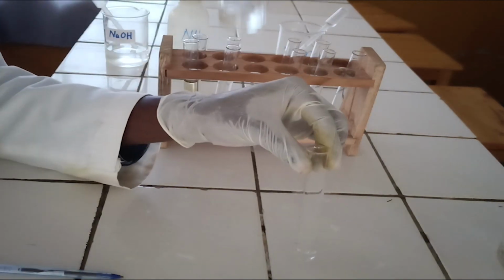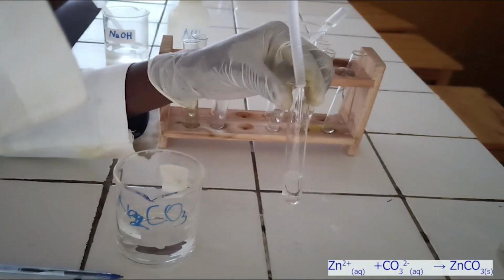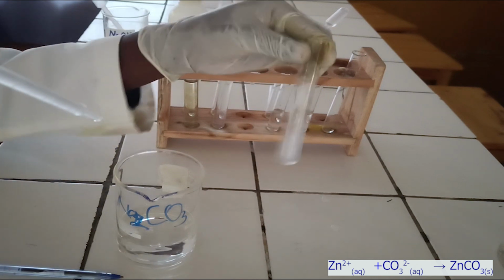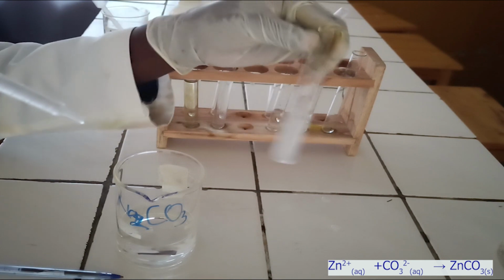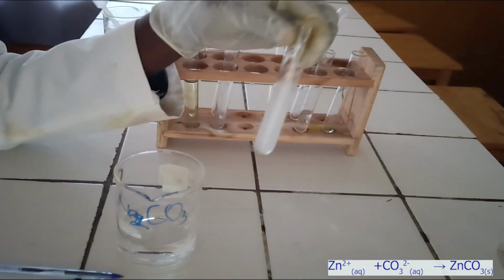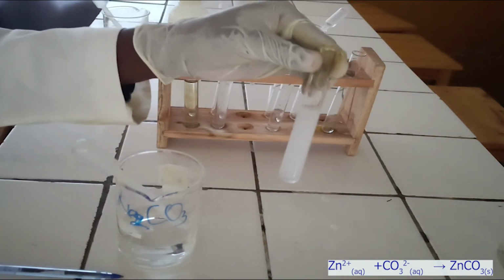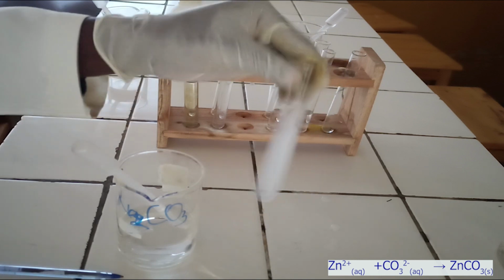To the third test tube, add sodium carbonate solution dropwise until in excess. As you see, sodium carbonate reacts with zinc ion to form white precipitate, which is insoluble in excess of sodium carbonate. Below, there is ionic equation for this reaction.